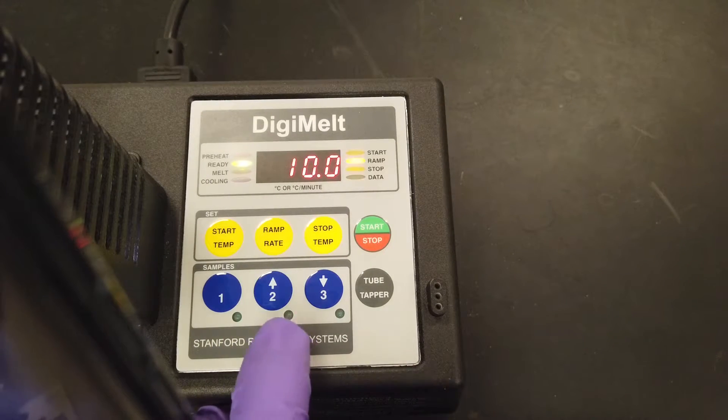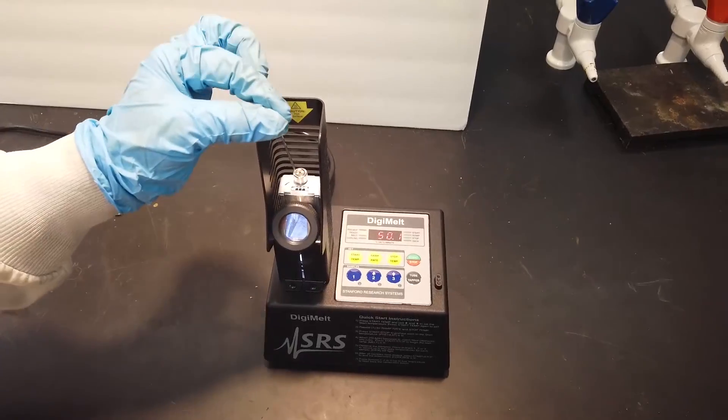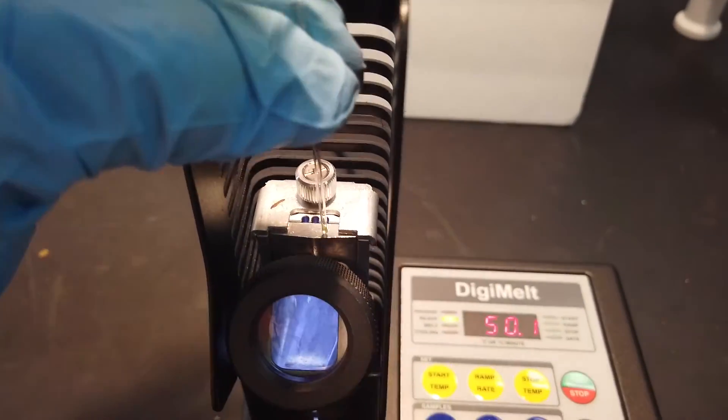Don't forget to switch the ramp rate to a lower rate, such as 2 degrees a minute, for the actual measurement. Insert your capillary tube into the top of the apparatus. Note that you can run up to three samples at a time.